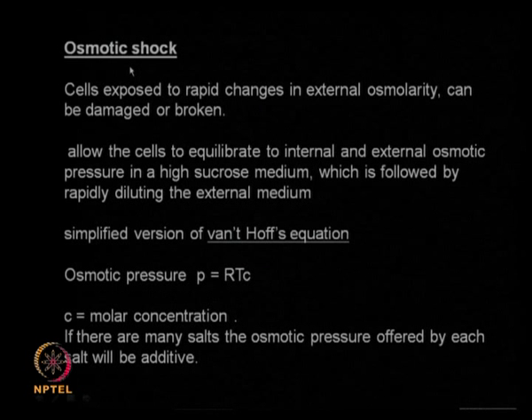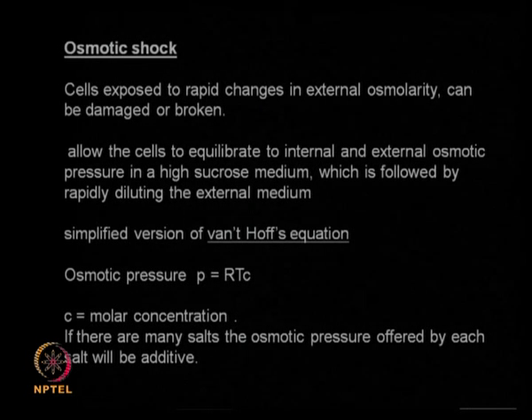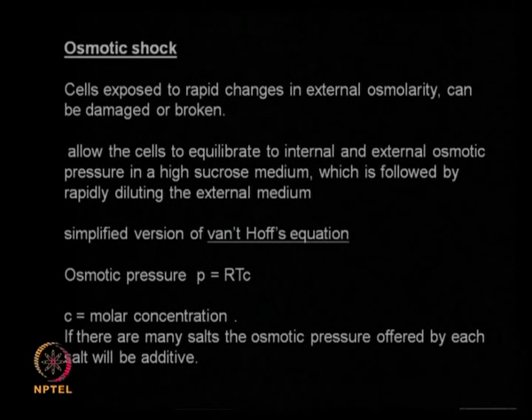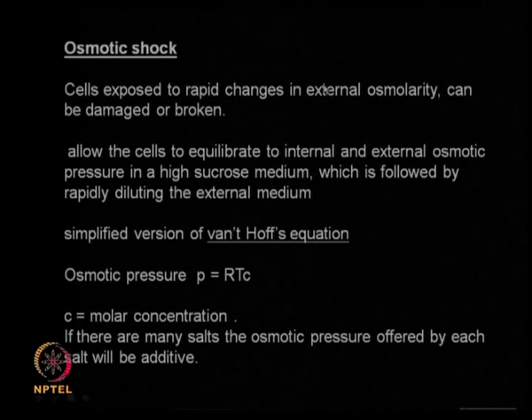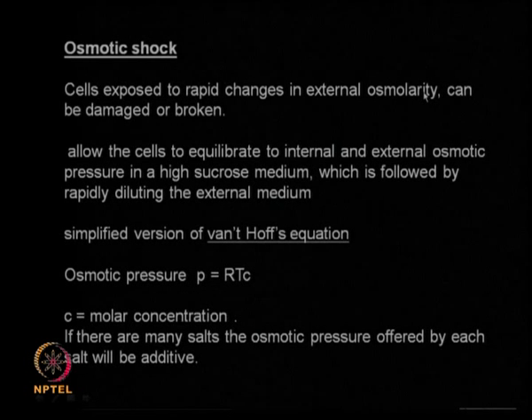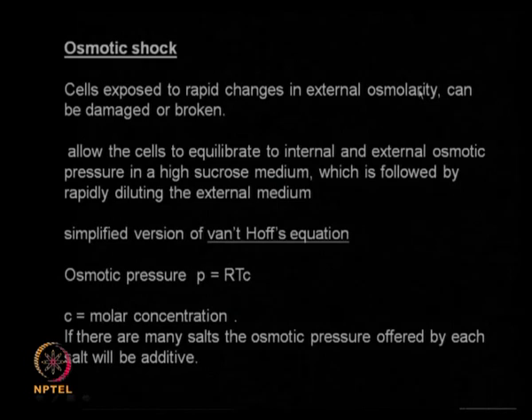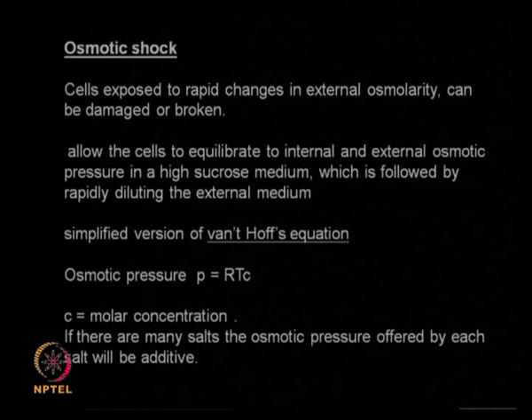The next method, which is not mechanical, is called osmotic shock. It is based on the concept of osmotic pressure. When cells are exposed to rapid changes in external osmolarity, the cells take much longer to adjust between the internal and the external pressure, so there is a breakage of the cell wall.